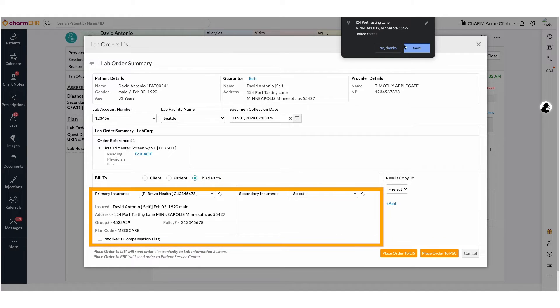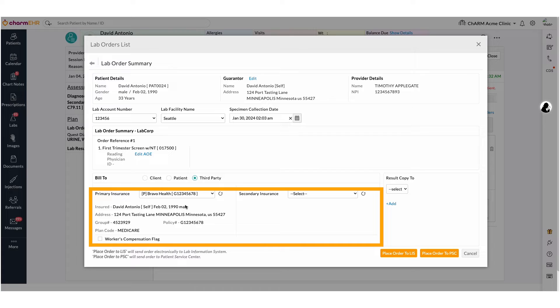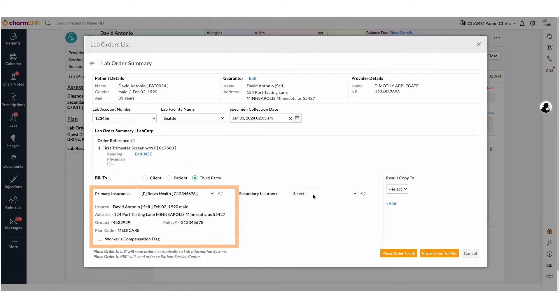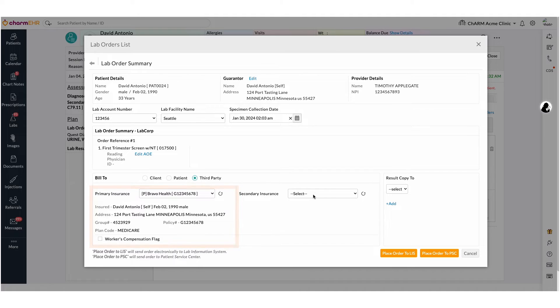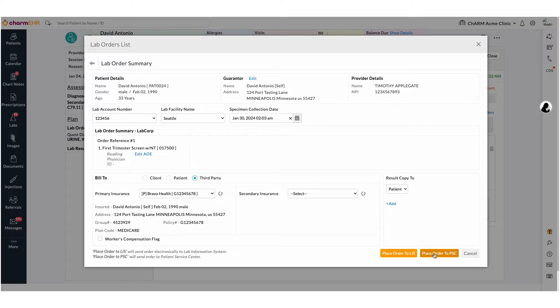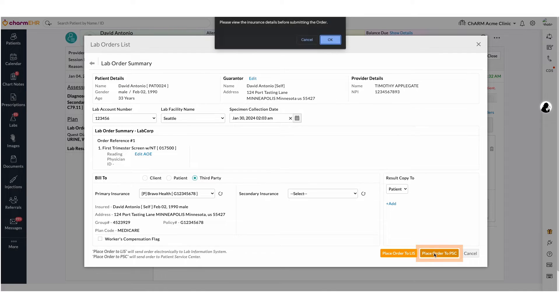Insurance details are pulled from the patient demographics section, patient details, and the insurance section. Primary insurance details are mandatory for third party billing. Click the Place Order to LIS or Place Order to PSC to transmit the lab orders electronically to the lab.